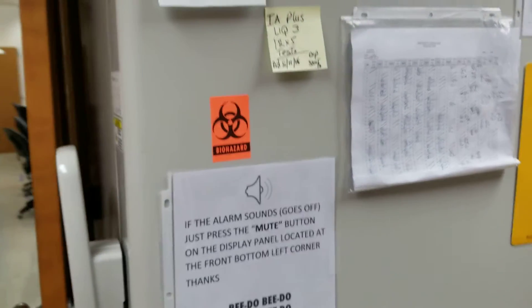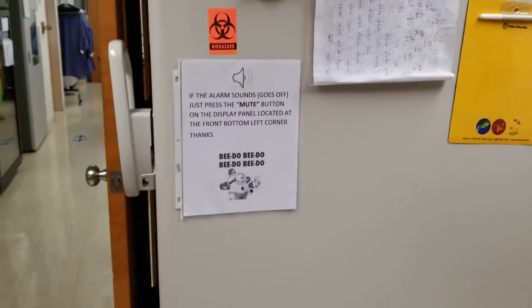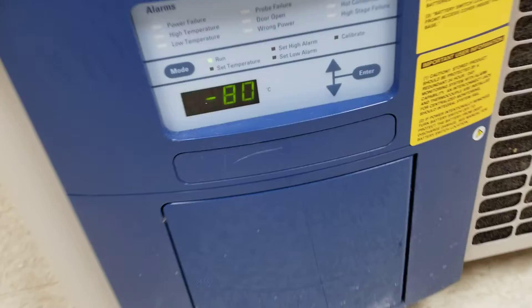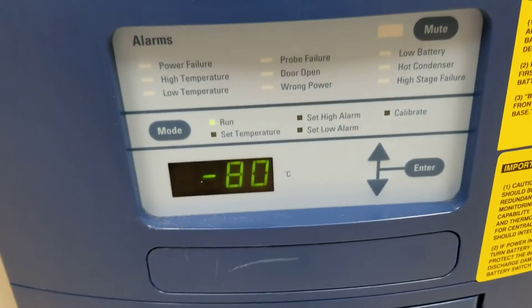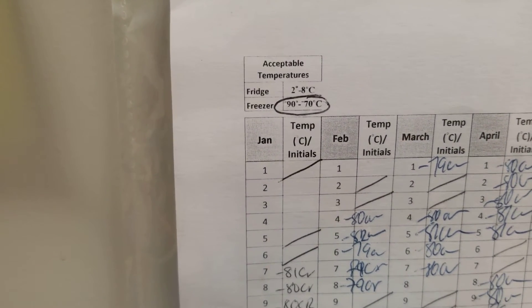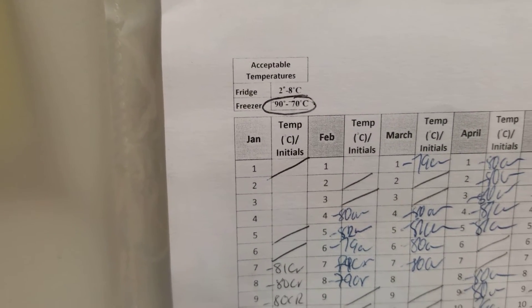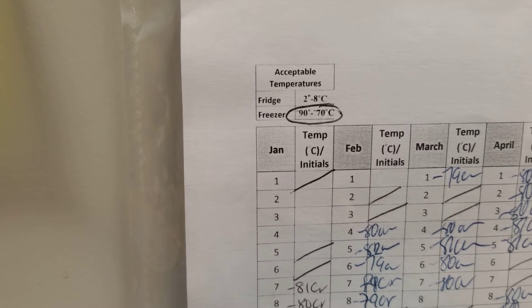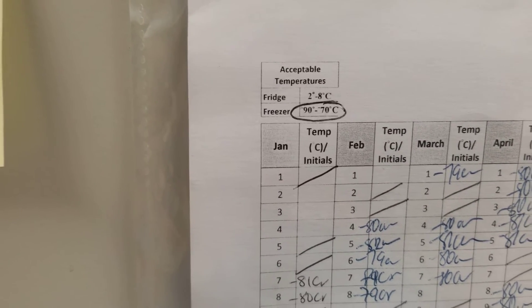Here is the deep freezer. It's a really, really big unit and the temperature is read down at the bottom. If you notice, it says negative 80 — that is wonderful. We have our temperature charts here and it's circled which one you should be looking at. The temperature range is negative 90 to negative 70, so negative 80 is right in the middle. That's perfect.